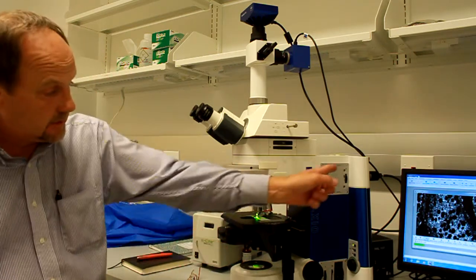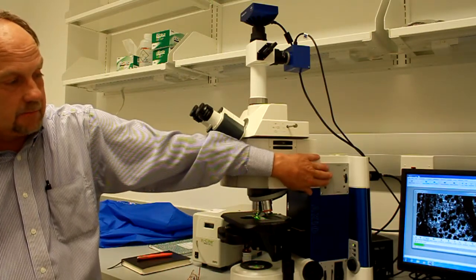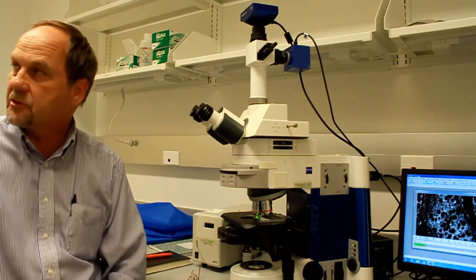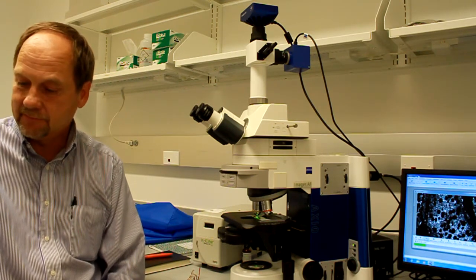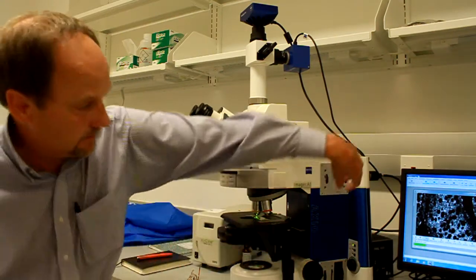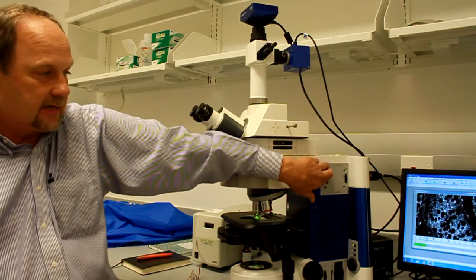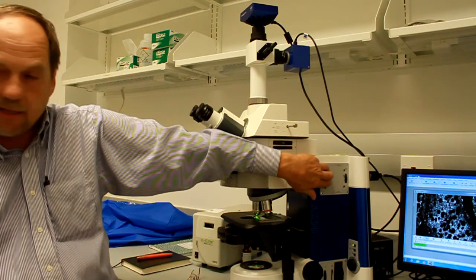But for the camera itself, it sometimes likes this closed because it reduces glare. You know, your samples aren't perfect in fluorescence sometimes. You might have extra mounting medium in there, or didn't squish the cover slip down. That can help correct that. So just close that down to the camera field of view, something like that, and that can help.